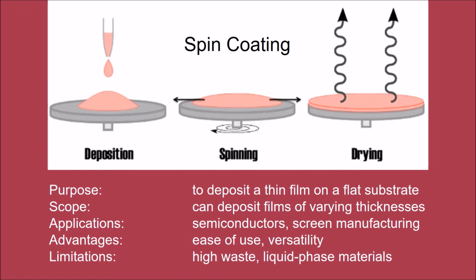The advantages of spin coating are the simplicity and relative ease with which the process can be set up. Spin coating can achieve thin and uniform coatings, which is another advantage. The high spin speeds result in high airflow, which leads to faster drying times, which results in high consistency at both macroscopic and nano-length scales.